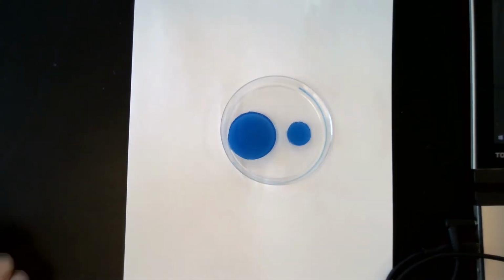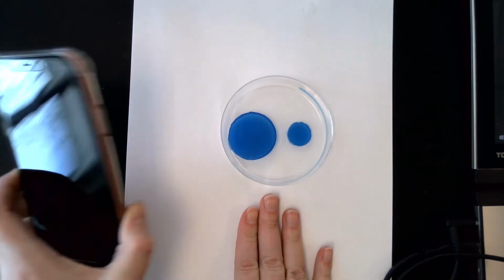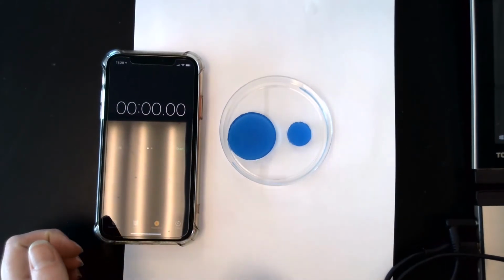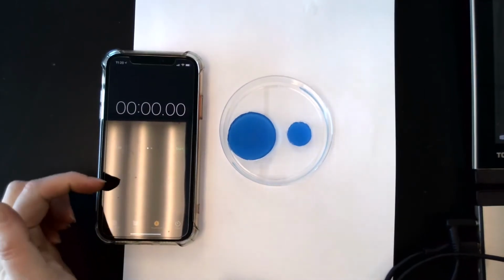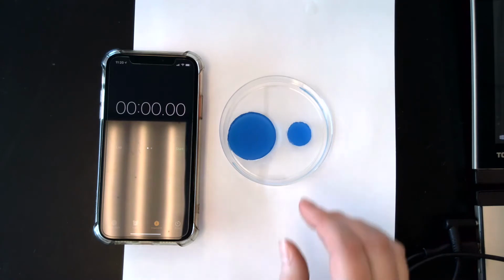Alright, as you can see, I switched this around because it was a little bit too bright. So I've got my discs here, and I've got my timer, so it shouldn't take very long. My stopwatch here on my phone should do just fine. What we're going to do is put that vinegar in and see how long it takes for these to change color.